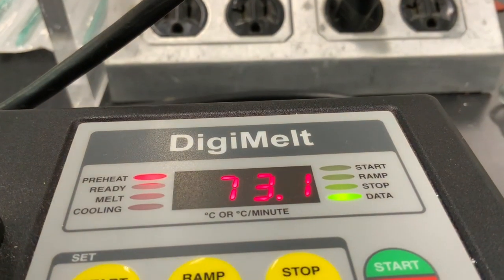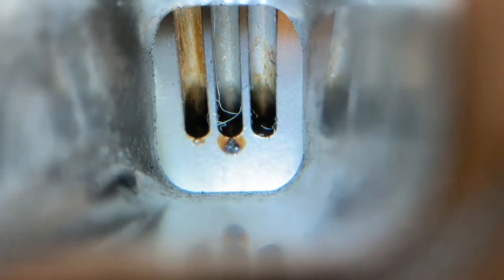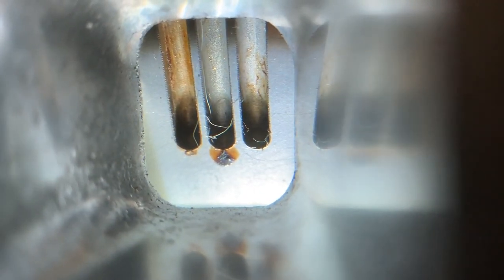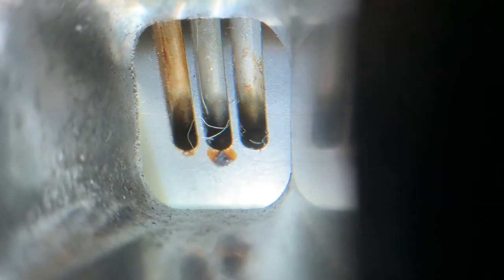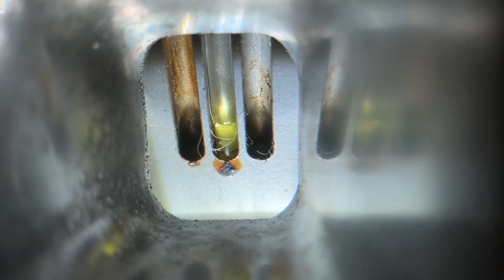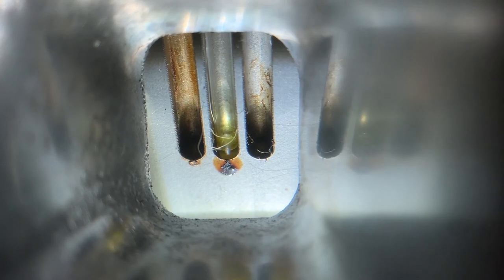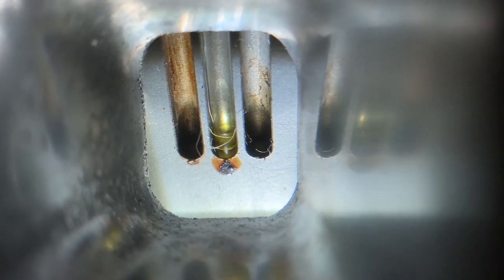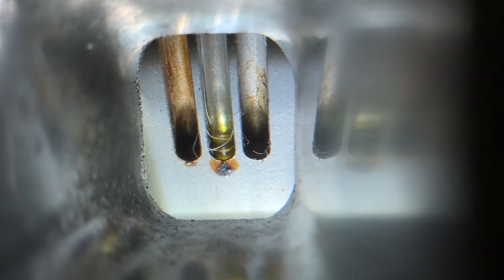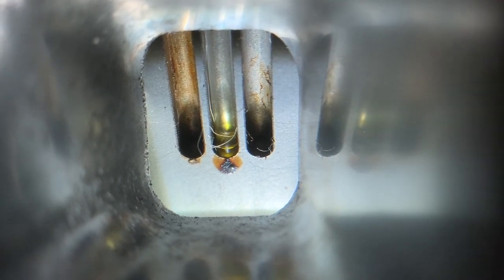All right, so the Digimelt's getting ready. It's at 73. It shouldn't melt. If I put it in there and it melts, I think it's just that all the methylene chloride hasn't boiled off, which is depressing it because methylene chloride boils really well. Yeah, it's melting right away. I think it's just impurity because not all the methylene chloride has dissolved away. So a more accurate melting point would be taken when it's more dry.